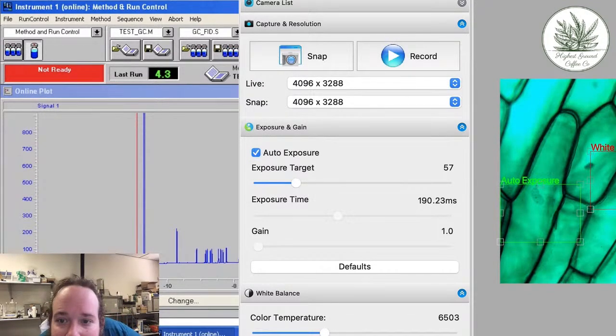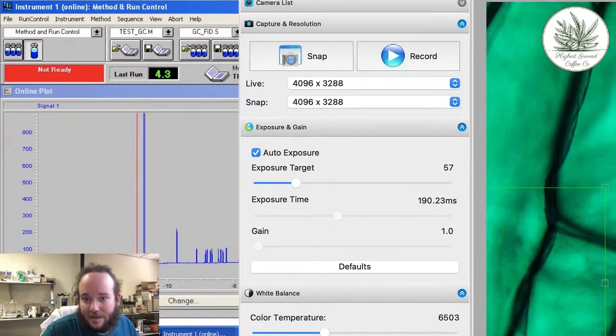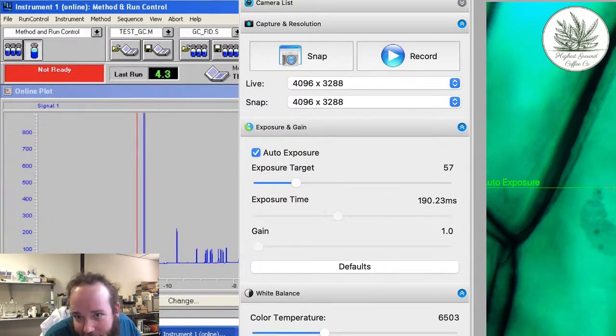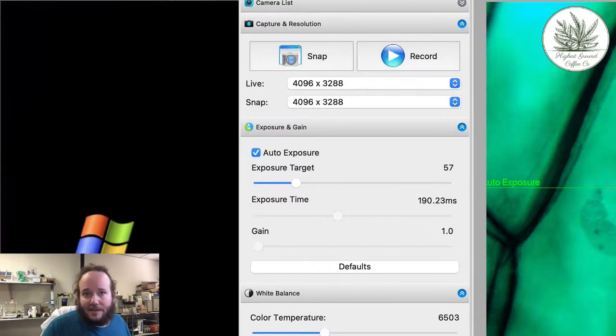So you can definitely start to make out some of these structures, and you can see some of the stuff in there too. I thought there was a good one over here. So you can see the overall cell, right? And then we have this smaller cellular structure, and these are probably the nucleus or something like that. I don't know.